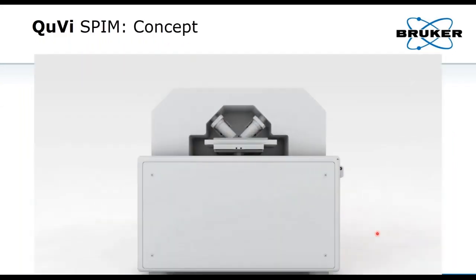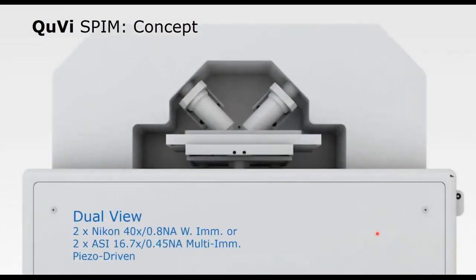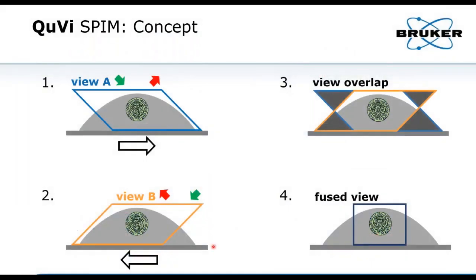And this is basically the concept behind this. We have our two objective lenses that we use sequentially, one for illumination, one for detection, and they just swap the roles, and then we obtain two orthogonal views of our sample. What does it mean in terms of data processing? We get this view A with illumination from the left and detection to the right, and then we swap and we have the illumination from the right and detection to the left, and these two views overlap, and with computer-based registration and fusion of the data, we can generate a nice isotropic 3D view of our sample.